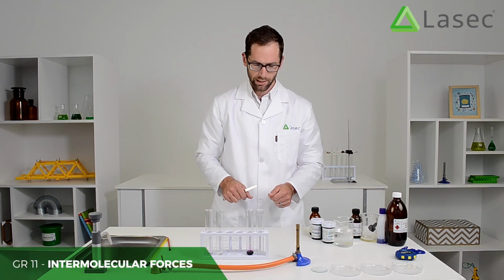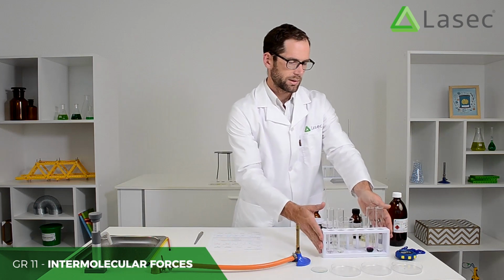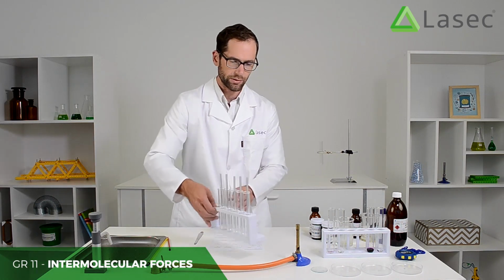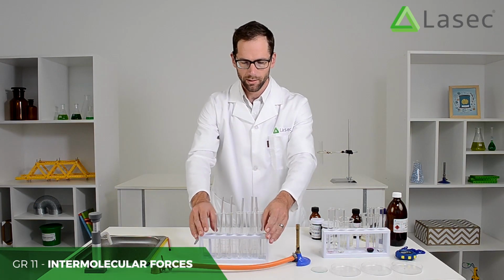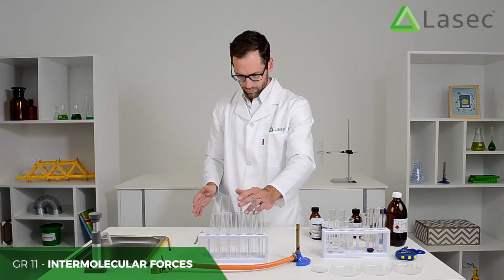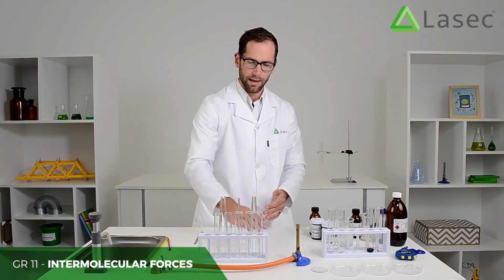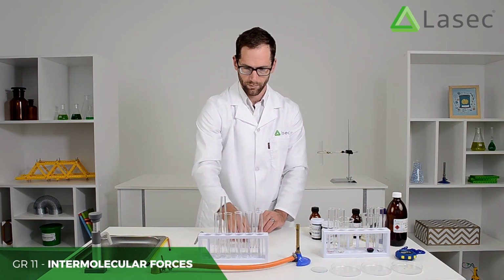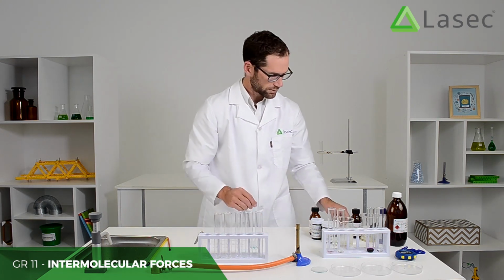Next I'm going to just take a look at capillary action, and then we'll take a look at boiling points. So for capillary action, you can use 1 capillary tube, but for the sake of brevity, I'm just going to use a few of them set up over here. And what we're going to need for that is 2 mils of water, of oil, glycerine, methylated spirits, and nail polish remover. I'm going to put the tube in and then see how high the liquid moves up the tube. Just take those out. Right, so we're going to do 2 mils of water.